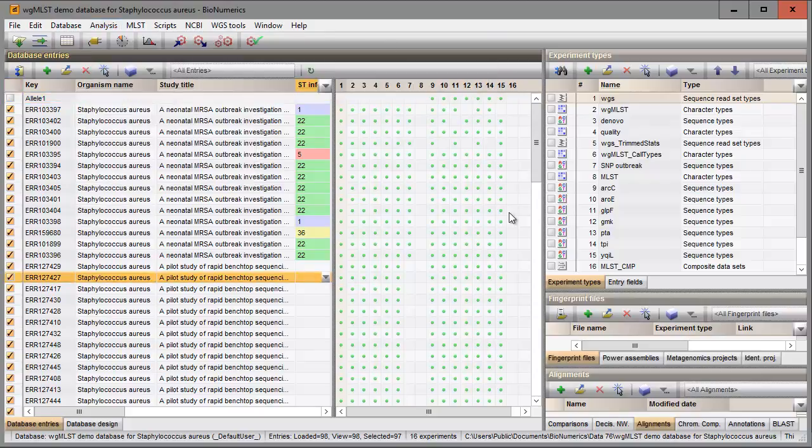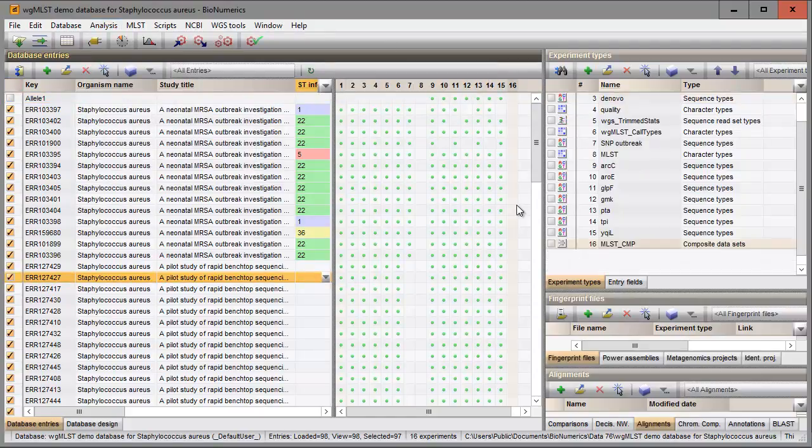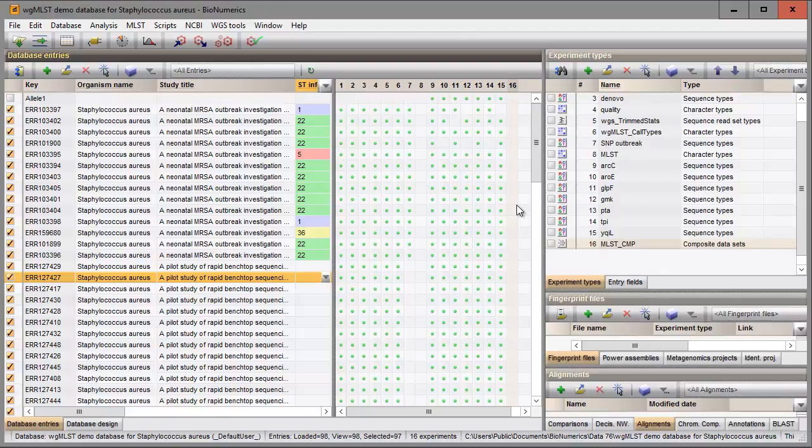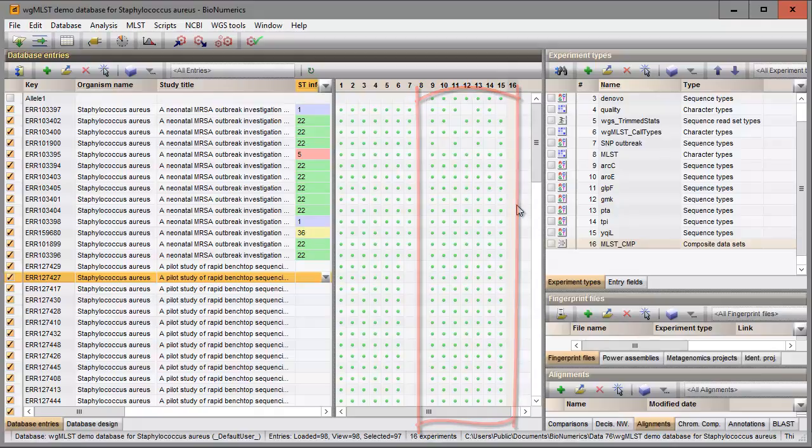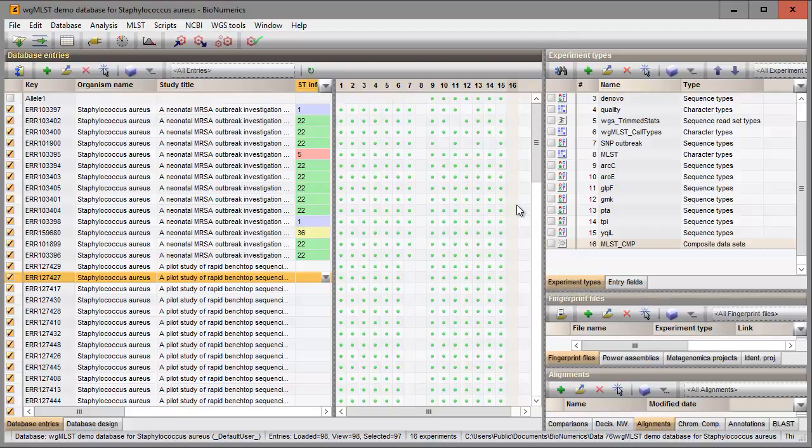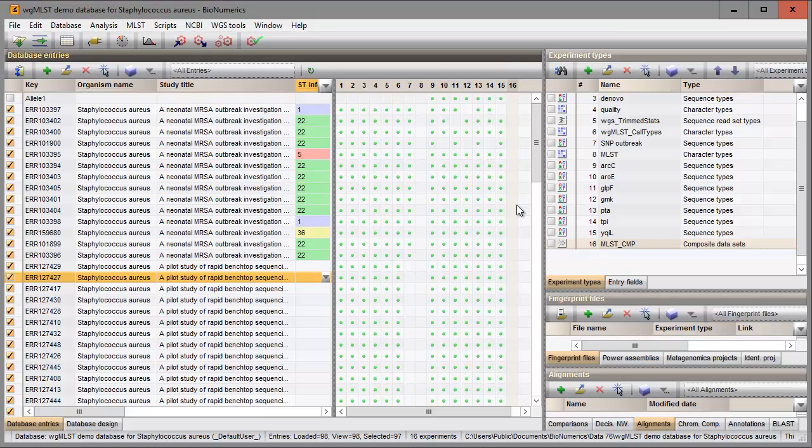The extracted sequences are stored in the destination experiments indicated with green colored dots in the Experiment Presence panel. Clicking on a green colored dot of one of the destination experiments will open the sequence editor displaying the extracted sequence.